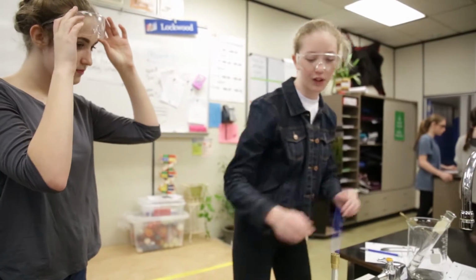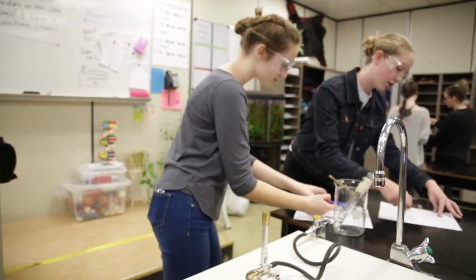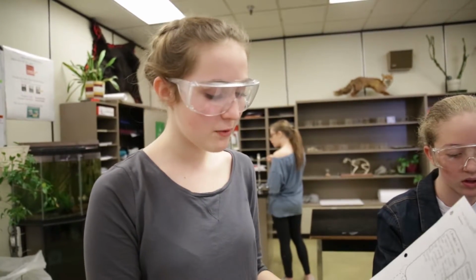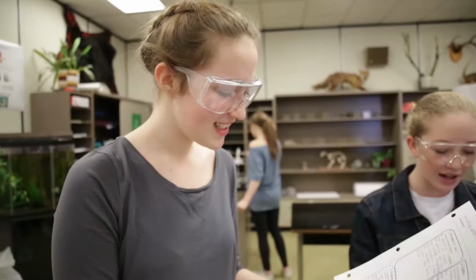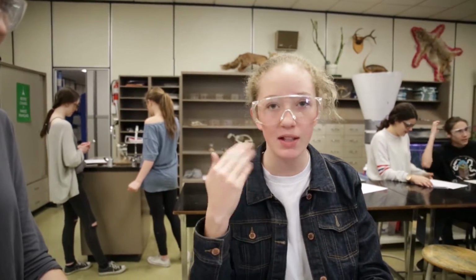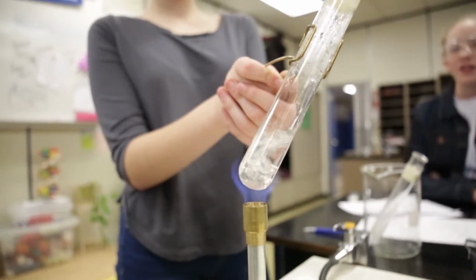I'm going to give it a while to cool off. Here, let's turn that off quick. Okay, all right. With observation A, we noticed a strong smell near the end when the solution was getting closer to being dissolved, and we noticed a lot of steam and some type of crystallization forming on the outsides of the test tube. Because when we left it on the first time, we only left it on for about 2 minutes because we didn't realize we had to wait until it evaporated. For the 2 minutes it didn't smell as much, and then when we put it on until evaporation, the odor became stronger because there were more sugar crystals. It's kind of weird to see the bubbles. One big bubble just goes up the tube.